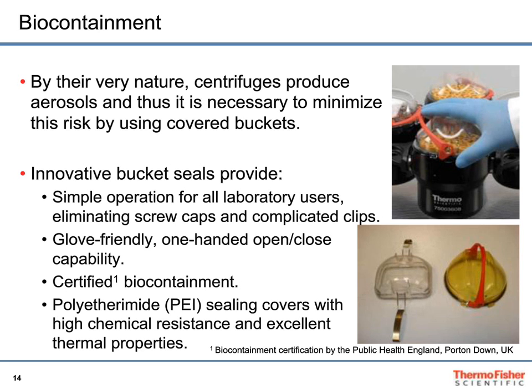And two things happened. One was, well, they're a little bit cumbersome to work with and clip on. But the other one was we need something that's glove-friendly. We needed something that was not liable to rip a glove or something. And some of you may know, or maybe you do it, there are many who go out there in double gloves. And the idea is, okay, if I tear the top one, then I've still got the second one for protection. And so the idea here is you're going to see more and more of this, where people are going to be putting together what we call a glove-friendly, easy-to-use closure system.